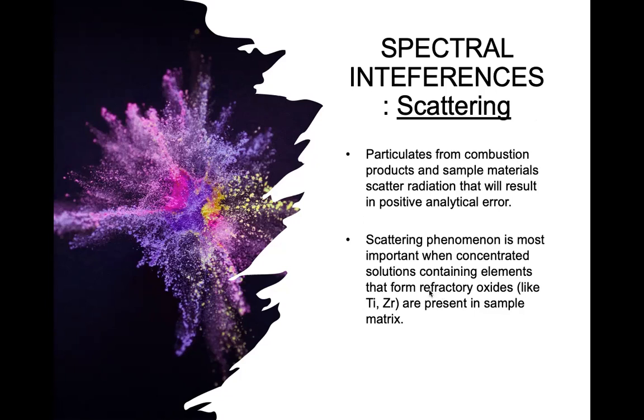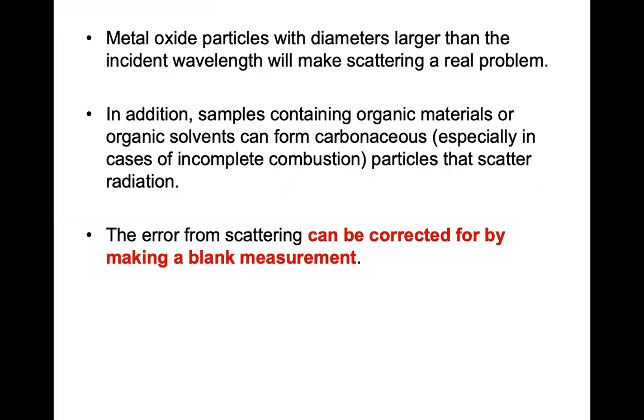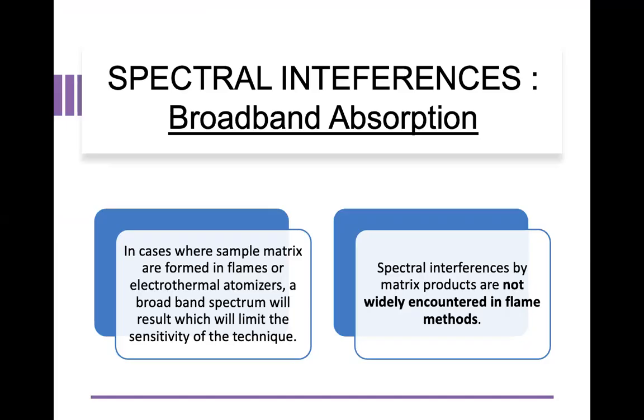That's why we have to work with diluted solutions, meaning low concentration solutions, to avoid this issue of scattering. And also we can do a blank measurement of the matrix itself, to zero the background effect, the scattering effect.